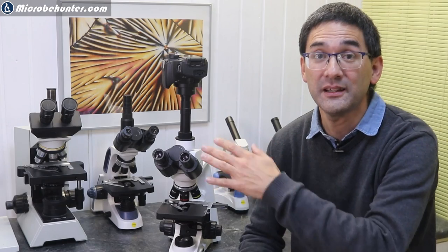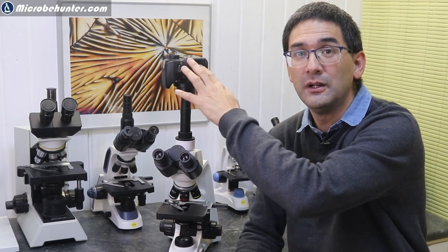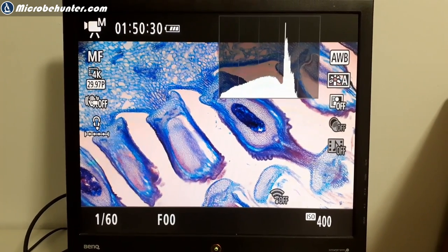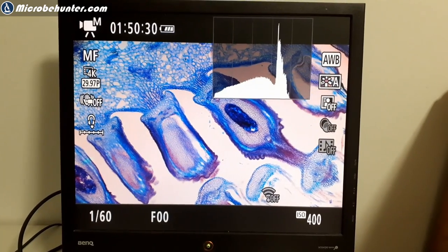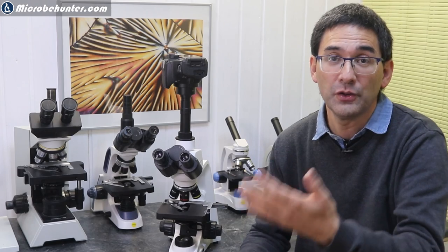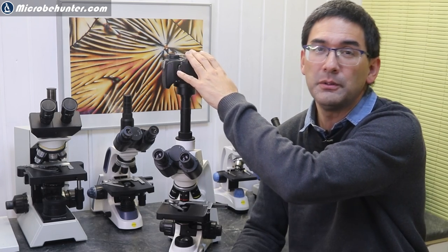If you haven't bought a camera yet and you need to make a choice about which camera to connect over HDMI, look for the feature called Clean HDMI. Clean HDMI means the signal delivered by the camera does not contain any of the additional on-screen information you'd normally see on the camera display. Older models simply mirror the camera screen over HDMI, which can be a little disturbing. Clean HDMI can be an advantage if you want to record video directly over HDMI rather than on the camera itself, though I generally still record on the memory card for the best resolution.